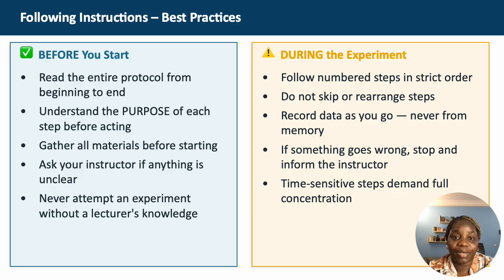The examples on the left and right panel here will show you the mindset, the preparation before and discipline during the experiment in the lab. So before you start, read the protocol. I repeat it again. Read the entire protocol. Understand the purpose of each step. Before acting, you need to understand why we are doing that. What is the purpose of this particular step, and why are we using this material? What is it used for?